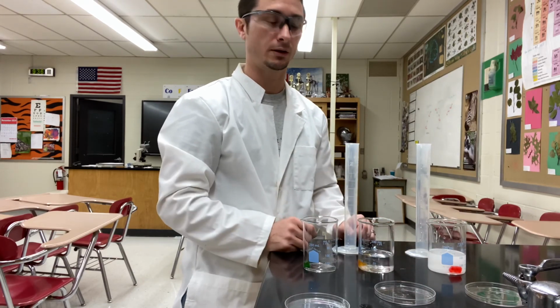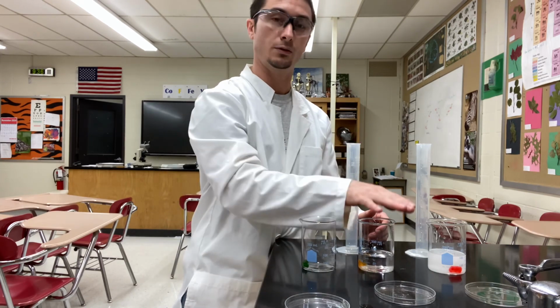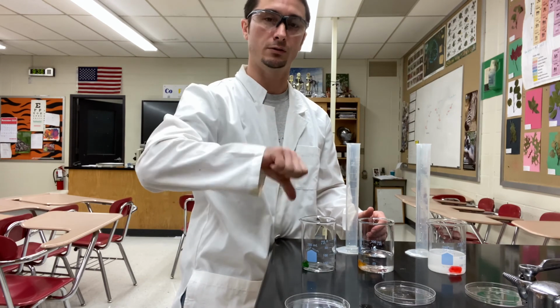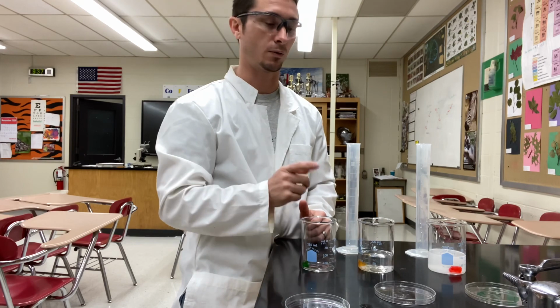Now, on your lab handout, it does require you to make some predictions. So what do you think will happen to the green one, the orange one, and the red one? Will they increase in weight, decrease in weight, or stay the exact same? Okay, you make your predictions, give it a go, and we're going to find out tomorrow.